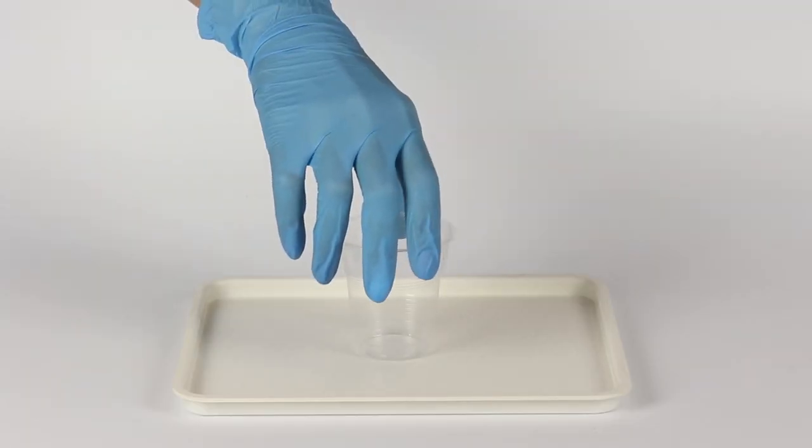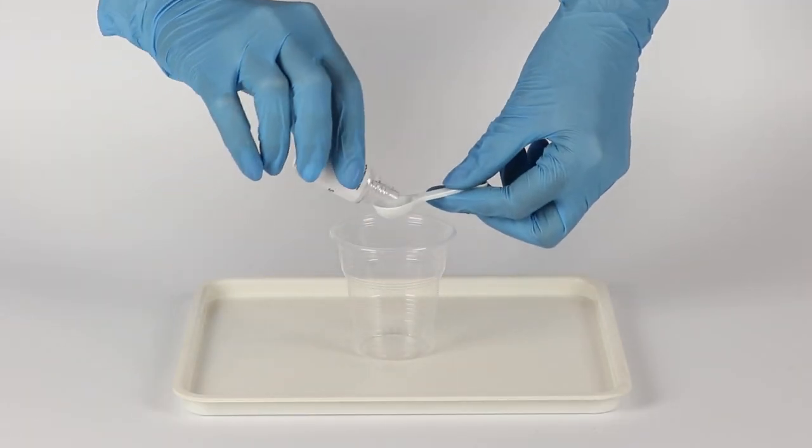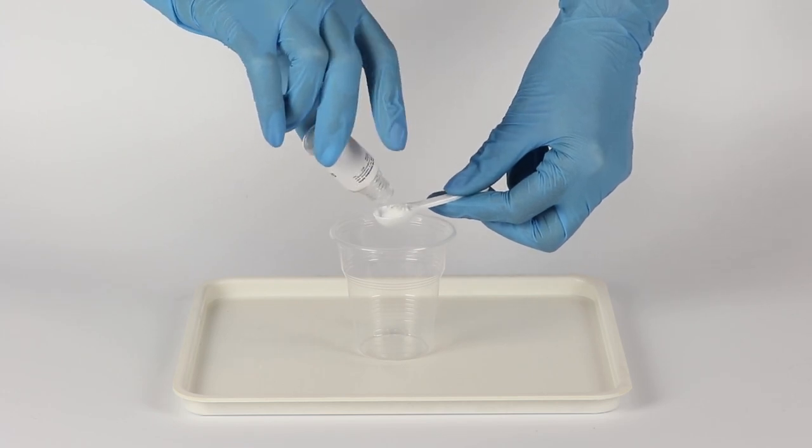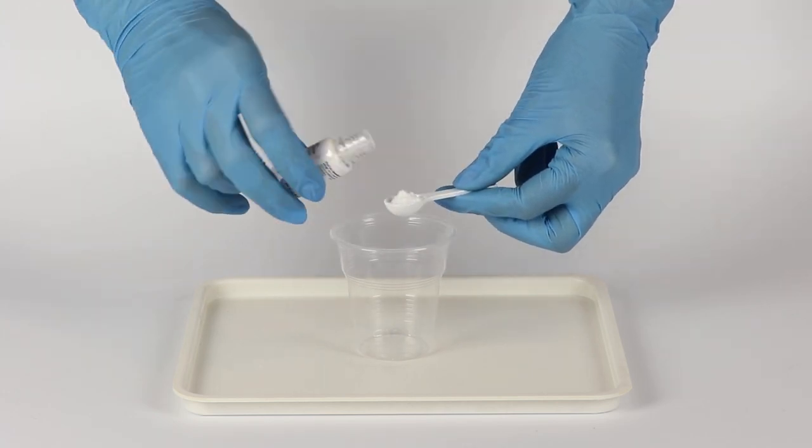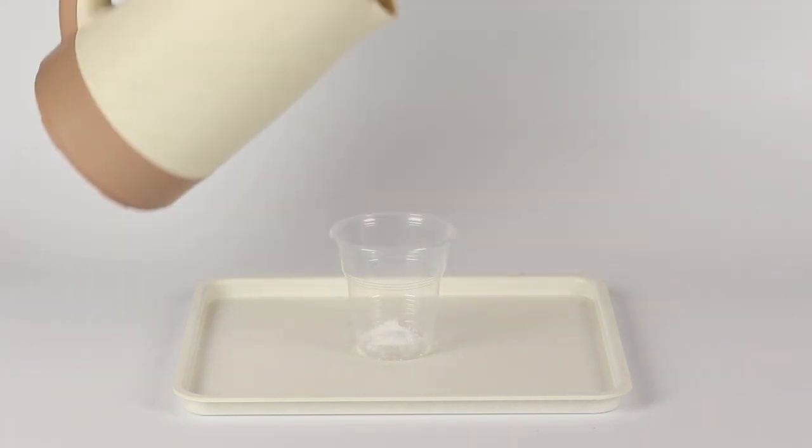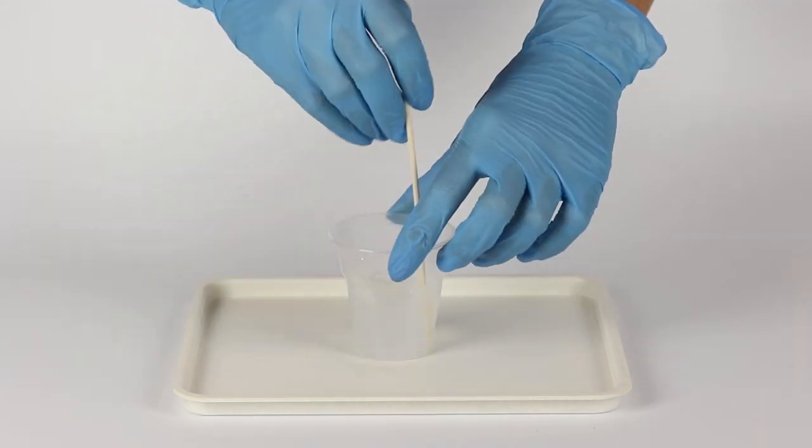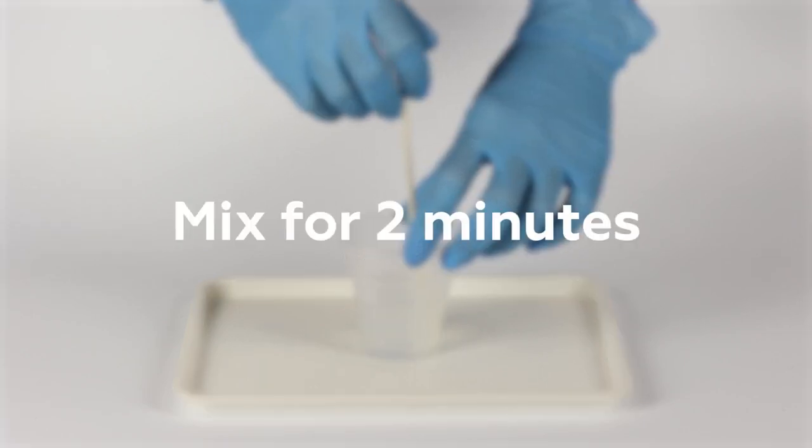First, prepare a starch solution. This will act as an iodine indicator. Measure one big spoonful of starch into a plastic cup. Fill the cup halfway with boiling water. Mix for two minutes using a wooden stick.